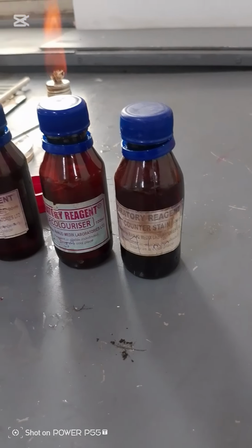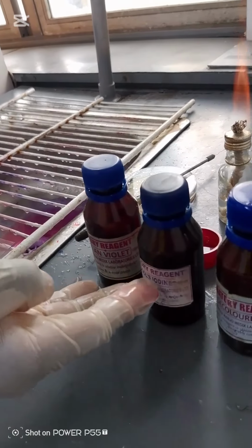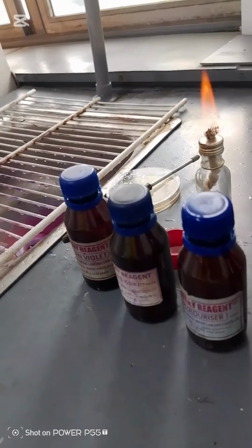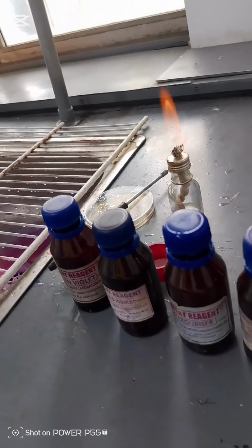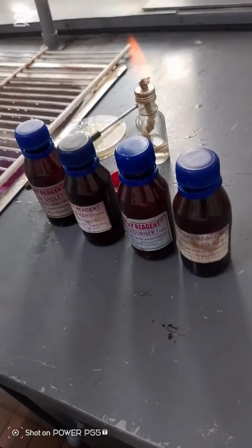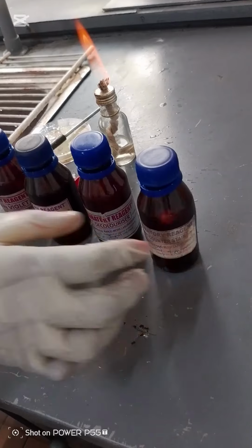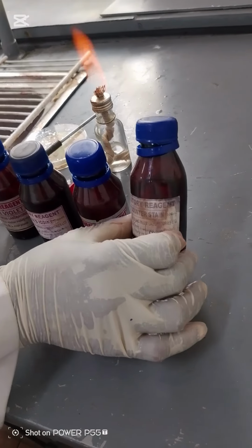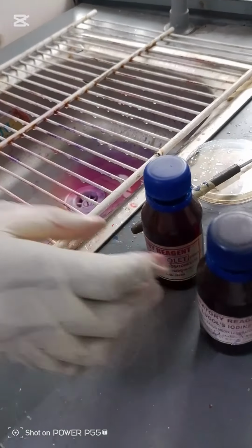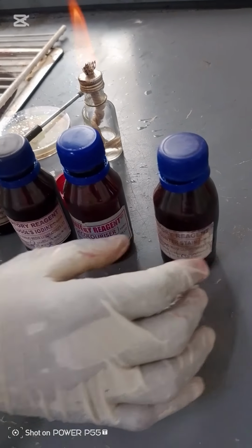But if it's a gram-negative bacteria, when you add crystal violet it picks the stain, and Lugol's iodine allows the stain to form a complex. But when you add the decolorizer, because gram-negative bacteria has less than 10% peptidoglycan and more lipopolysaccharide, it can easily be washed off by the decolorizer, which is an alcohol. Since the primary stain has been washed off, it will now pick the secondary stain. And that's why gram-positive bacteria is purple in color, picking the color of the primary stain, and gram-negative bacteria is pink in color, picking the color of the secondary stain or counterstain, Safranin.